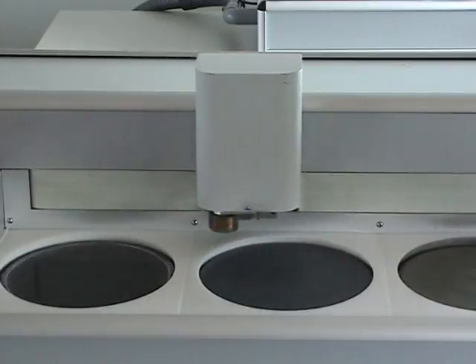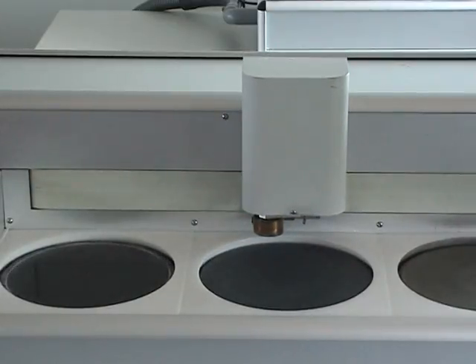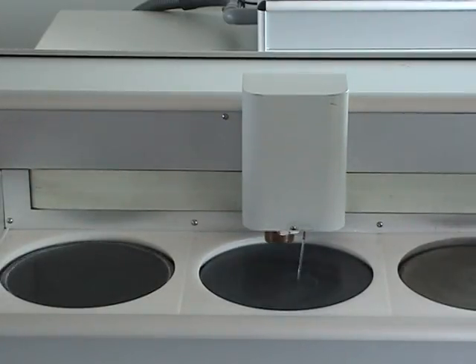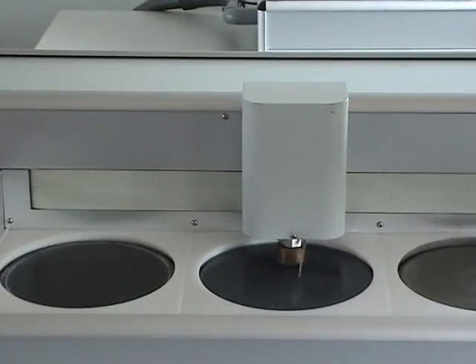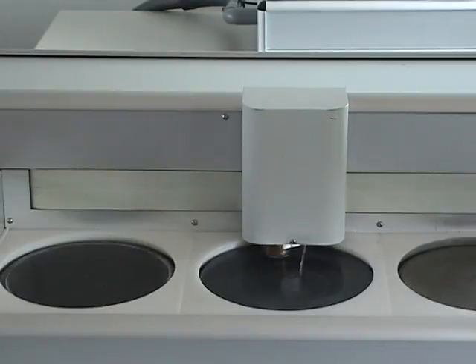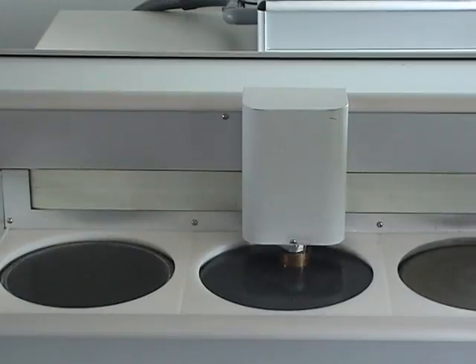After completing rough grinding, the machine will continue automatically with fine grinding.